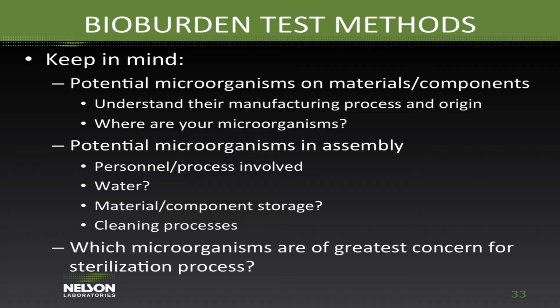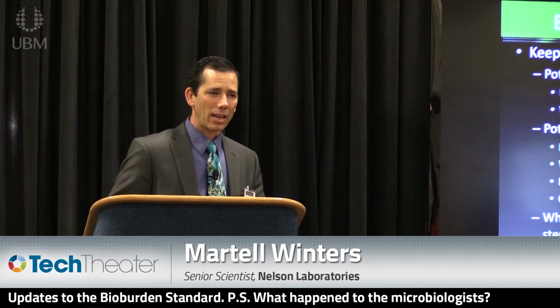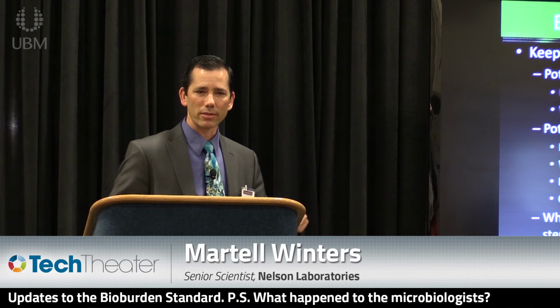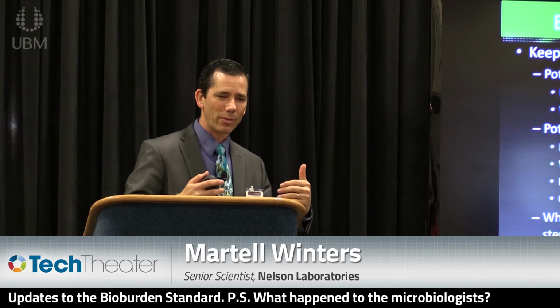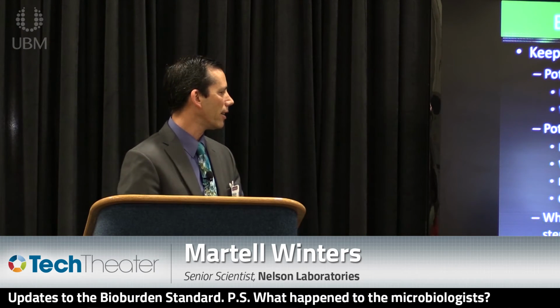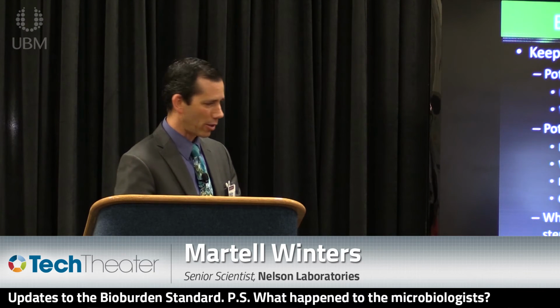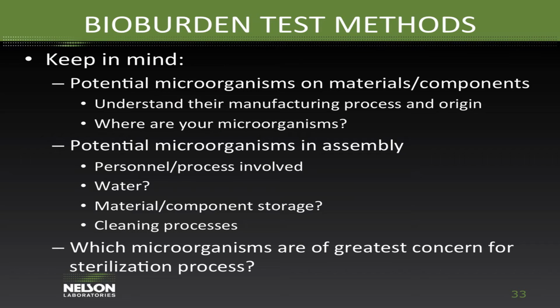Most of the cleaning processes I've seen actually add bioburden rather than take it away. People have this idea, well, I get these things from my supplier, I need to wash them off in some water and do some cleaning there, and in most cases they're actually counterproductive. And another question to ask is which microorganisms are of greatest concern for your sterilization process? And those are things to keep in mind as you are establishing your bioburden test method.